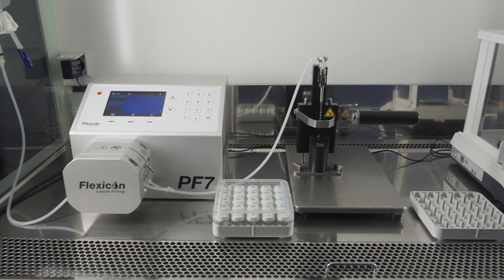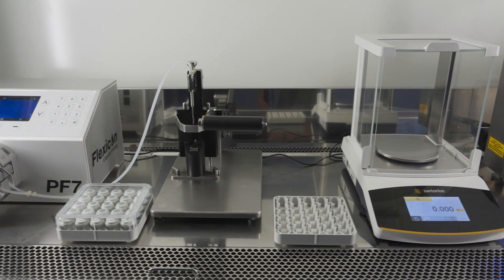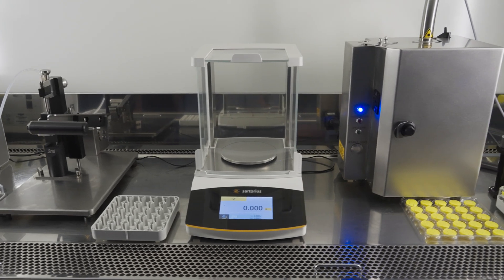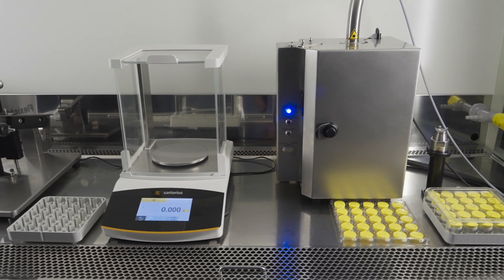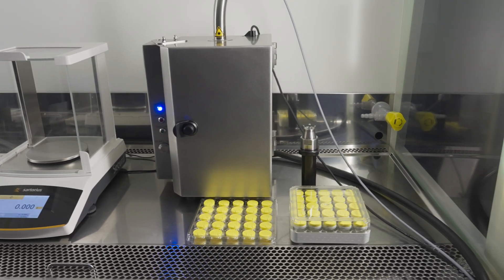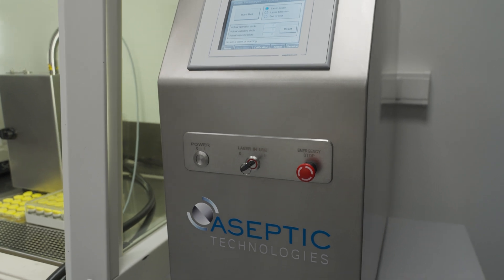The M1 consists of the filling tool with a peristaltic dosing system, the precision balance for calibration, the laser resealing unit, and the capping tool — altogether installed in the Grade A space — and the laser control unit located outside of the Grade A.